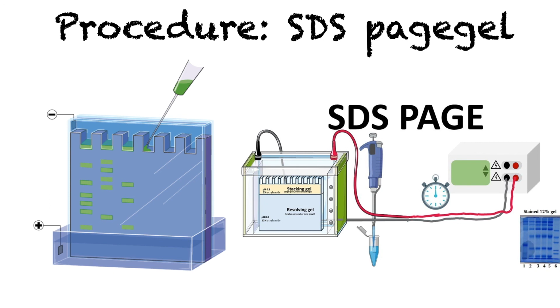The only thing we have to take care of during gel electrophoresis is to use the right type of gel, right type of buffer, right amount of current, and right time of the gel running period. And we have to take care of the sample loading. We shouldn't make any crack on the gel, and we have to use the right software to visualize our image.